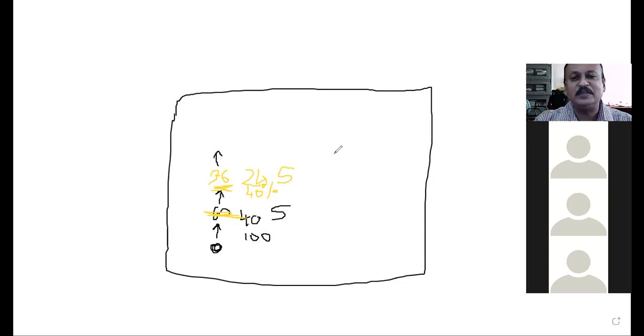So again, when the 36 molecules are moving ahead with the mobile phase and go to the next compartment, now the concept of compartment here is a theoretical one. You have to just imagine it. I cannot define how big the compartment is exactly. It depends upon the interaction, how many points are available on the surface for the interaction to take place.